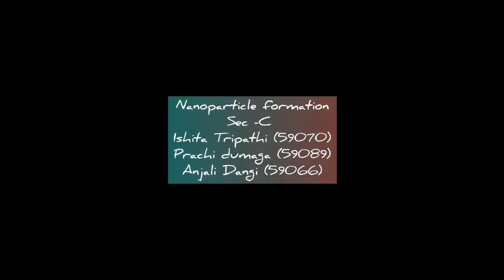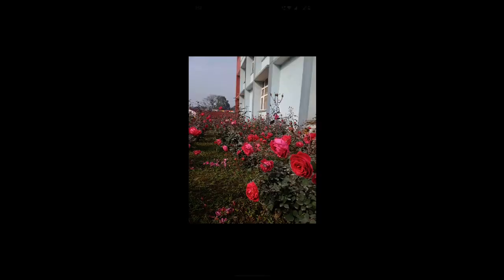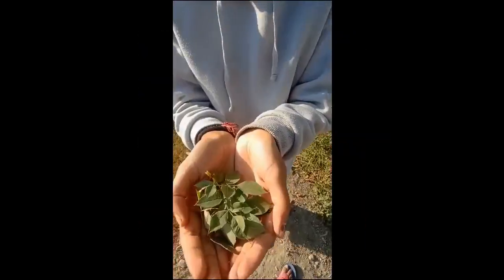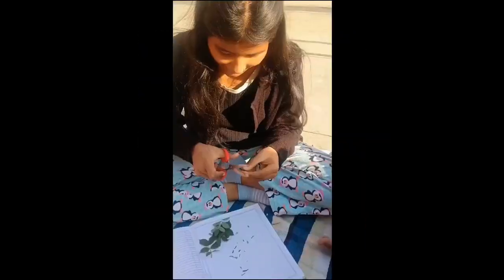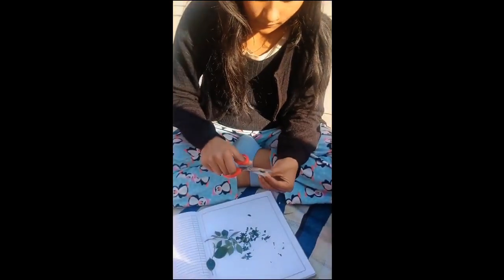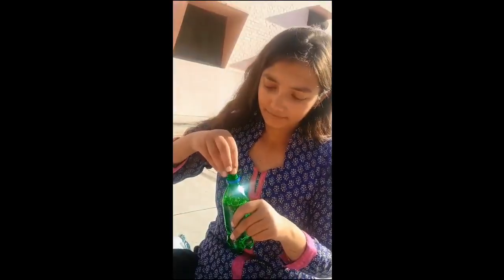Good evening, sir. Today we are going to explain nanoparticle formation from plant extract, and for this we are using the extract made up of rose leaves. So let's start with step 1. Firstly, we'll pluck some fresh leaves from the rose plant, and then we'll cut about 5 to 10 gram of leaves into small pieces. Now add these leaves into 100 ml of water.